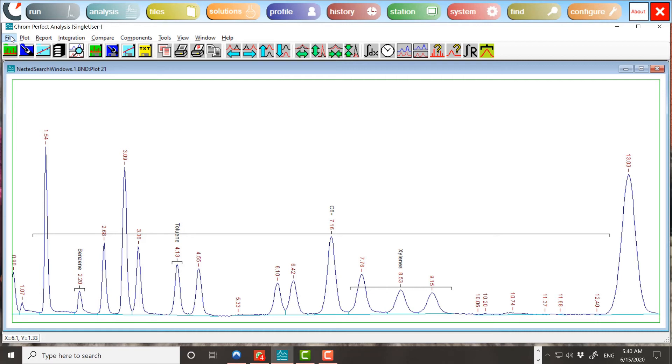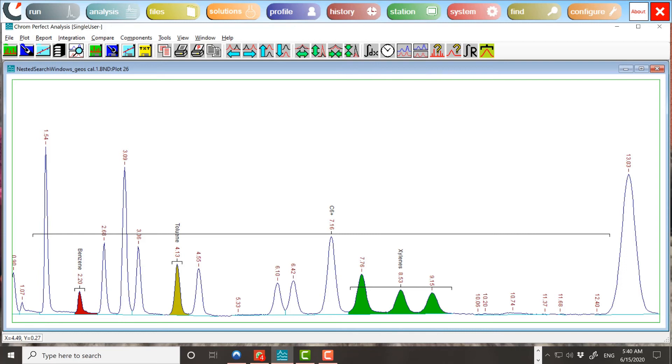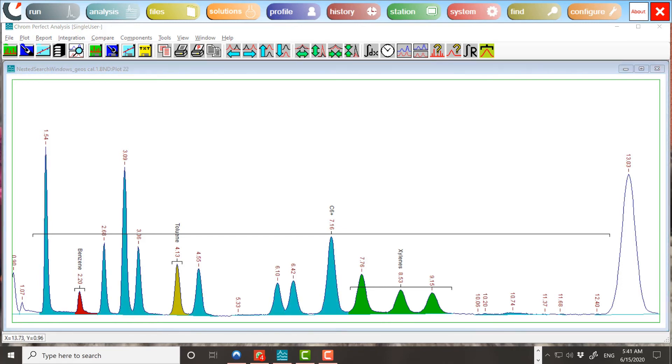Here, in a nutshell, is how the peaks get sorted out. The benzene and toluene windows are the smallest, so they go first. These are normal single-peak windows, so they mark their identified peak only. The xylenes window goes next. It is a multi-peak window, so it marks all peaks within its search window, the three peaks between 7.76 and 9.15 minutes.